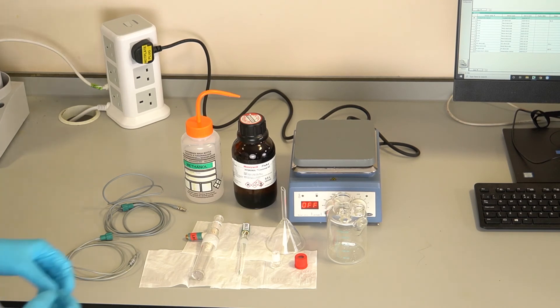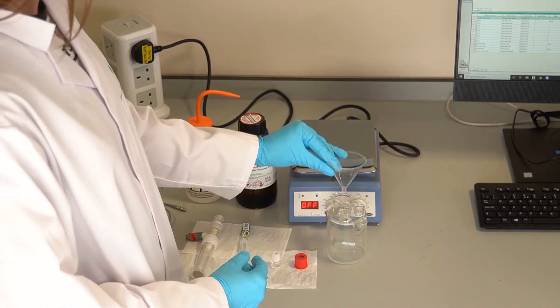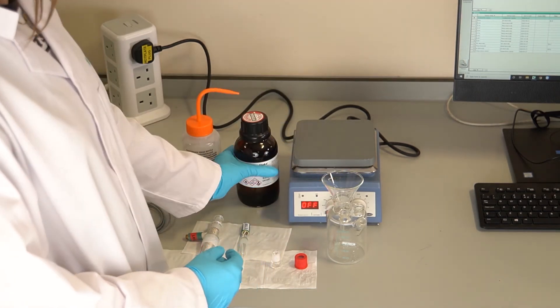Once all residual water has been removed, add fresh Karl Fischer reagent. We recommend 150ml of reagent for coulometric cells.